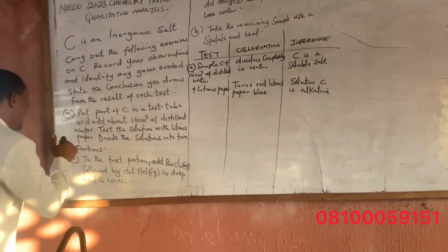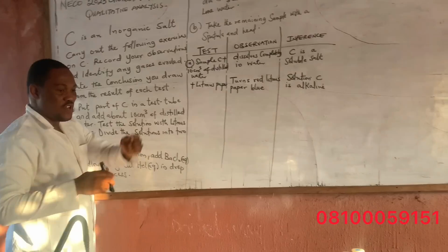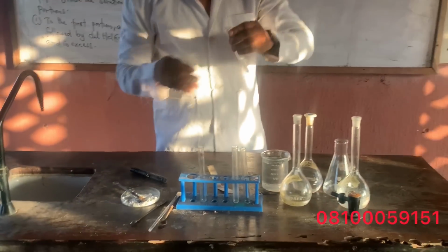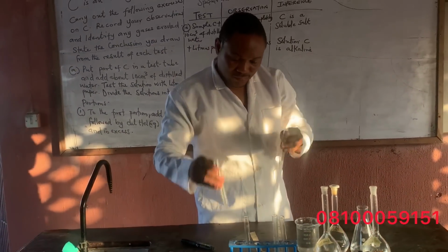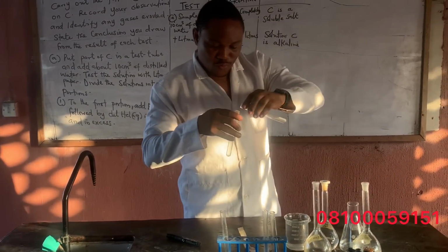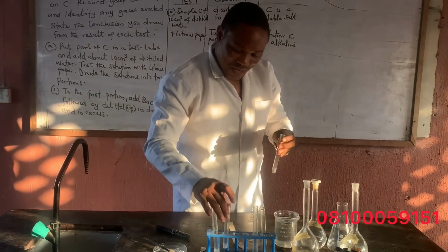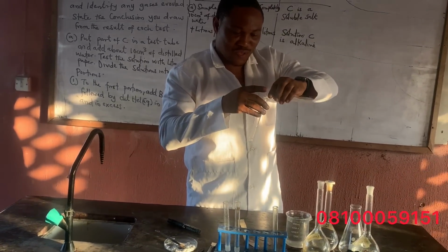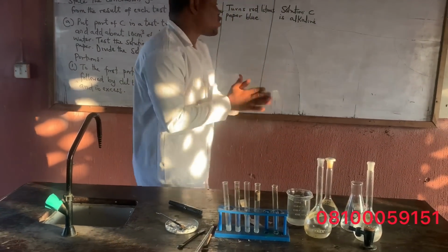Okay, let's move on. Divide the solution into two portions. So this solution, we are dividing into 2 portions. But I will divide into 3 because I still want to show you something. I love this practical, it's very interesting. So let me just have 1 as a reserve. But we are just using 2 portions.